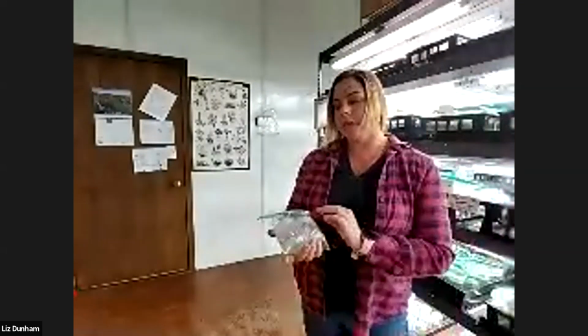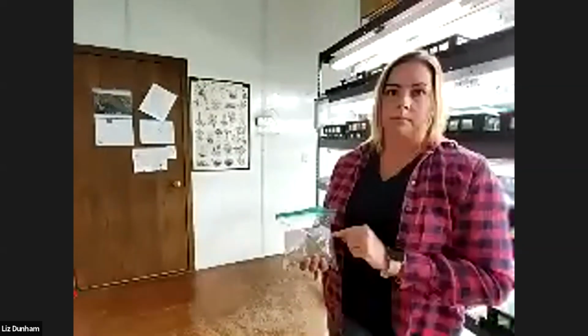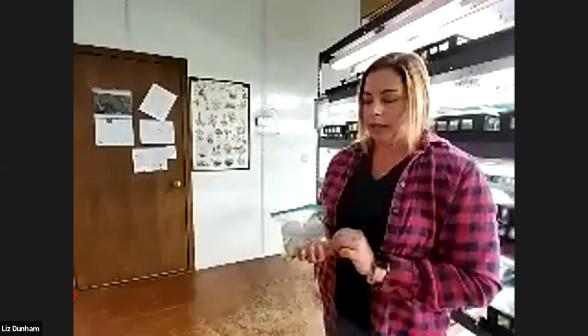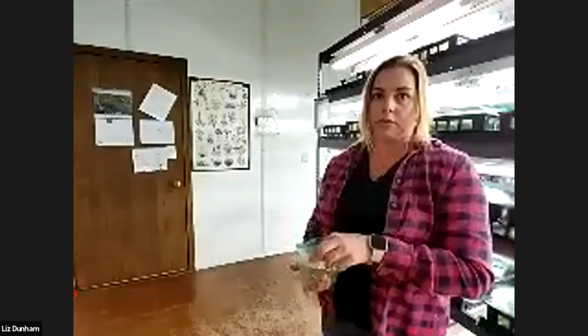So we grow everything in these bags because the number one thing that's going to take down a tissue culture lab, besides mixing plants up and then selling them as the wrong thing, is going to be thrips. And this is just an extra line of defense for us against the thrips. They have to get through the baggie and then in through the top and then propagate themselves in there. We have had thrips. I think every lab probably has had them. And we have our own protocol in order to deal with them. It is just one of those pests. It's the number one pest for a tissue culture lab.